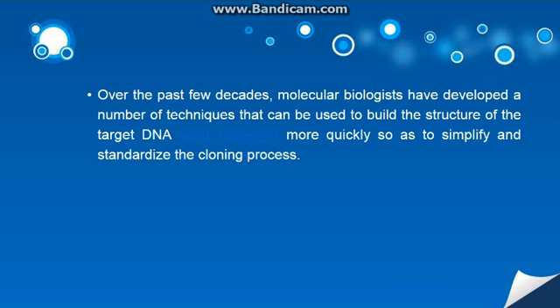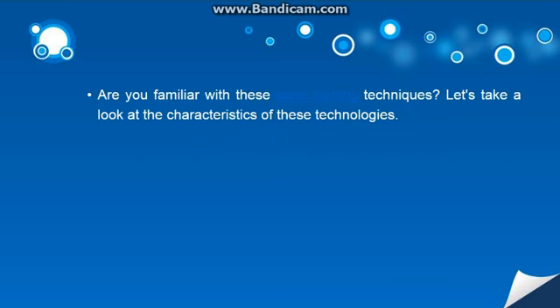Over the past few decades, molecular biologists have developed a number of techniques that can be used to build the structure of the target DNA seed sequence more quickly so as to simplify and standardize the cloning process. Are you familiar with these gene cloning techniques? Let's take a look at the characteristics of these technologies.